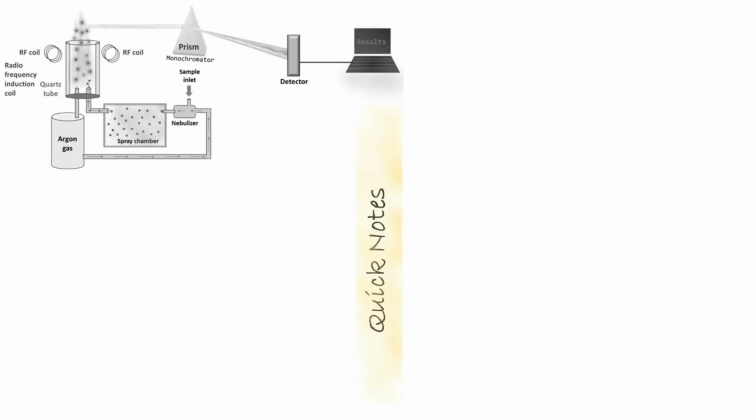Now let's say this question is asked in your exam. So here is what you can do. First, draw the schematic diagram. Next, explain the principle.